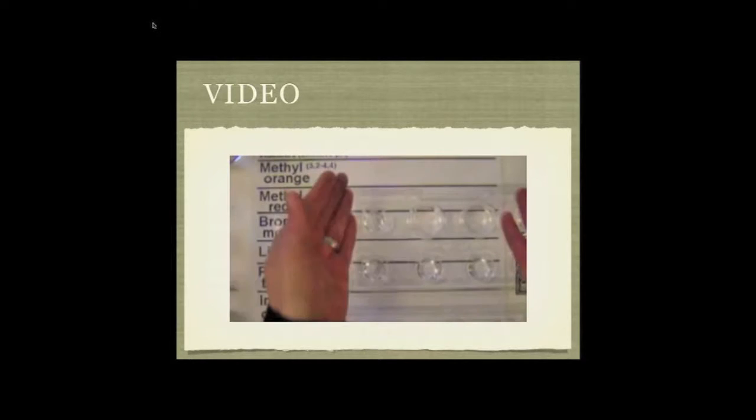The change takes place at pH 7. Indigo carmine is a much higher pH, closer to an 11, 12, or 13 base. So hopefully our hydrochloric acid and sodium hydroxide are going to be able to indicate or show us at least some color changes, what to expect.